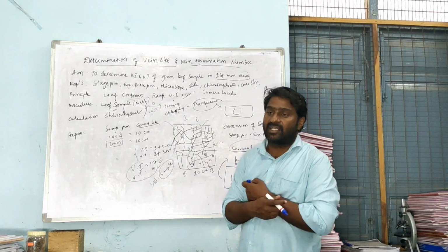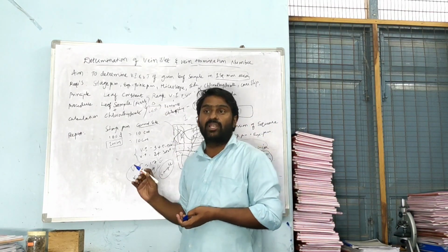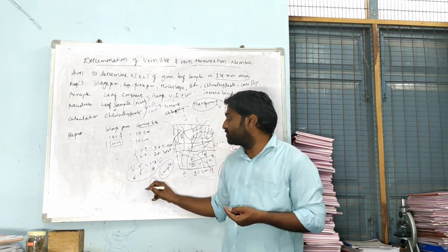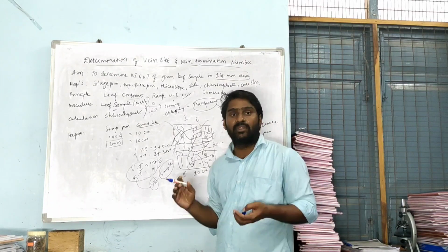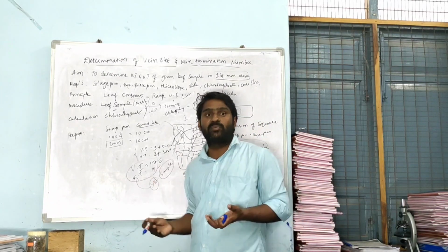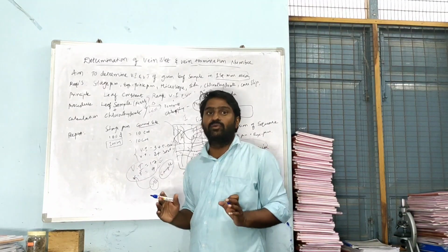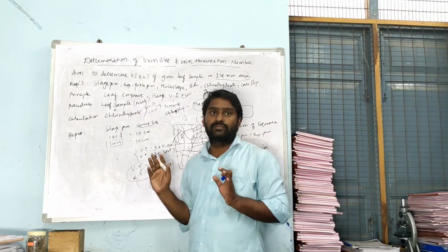So what is the standard? The standard is nothing but whichever value is mentioned in the textbooks or given in the monograph of the individual drug. If the value matches with the monograph, then the given sample is identified and reported as the same sample, and we can confirm that the given sample is genuine and not adulterated. So with this our experiment is closed. Thank you.